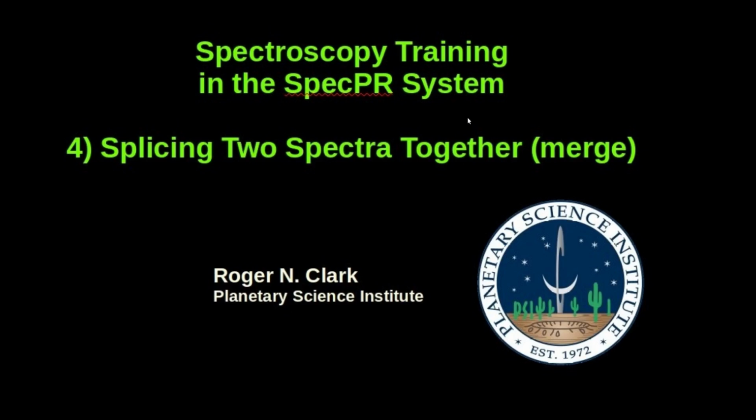In this video, I'm going to describe how to splice two spectra together from two different spectrometers in Specpr. This is called a merge. A reason we'd want to do this is to create one more complete, longer spectral range spectrum for use in comparison with other data, for example, spacecraft instrument data.